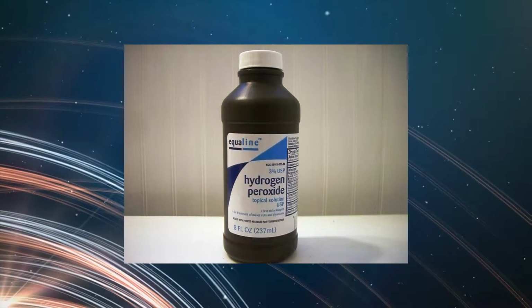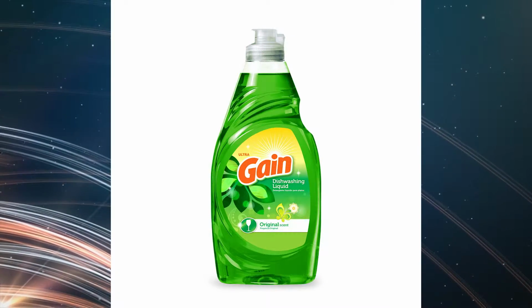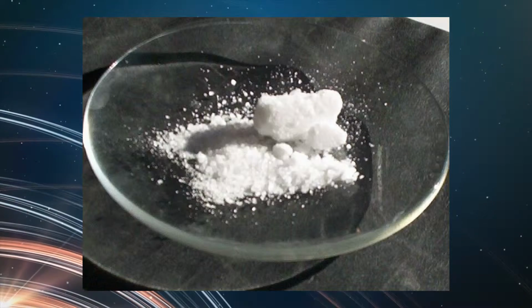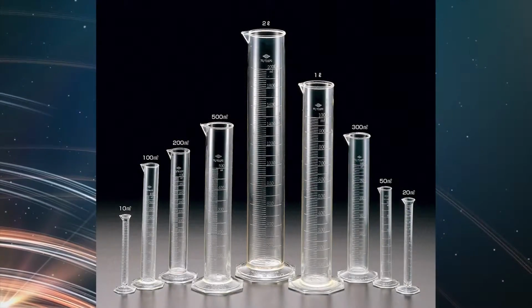For each of the two experiments, 20 ml of hydrogen peroxide and approximately 5 ml of washing detergent was added to 53.6067 grams of potassium iodide in a measuring cylinder. For each experiment, the potassium iodide acts as the catalyst.